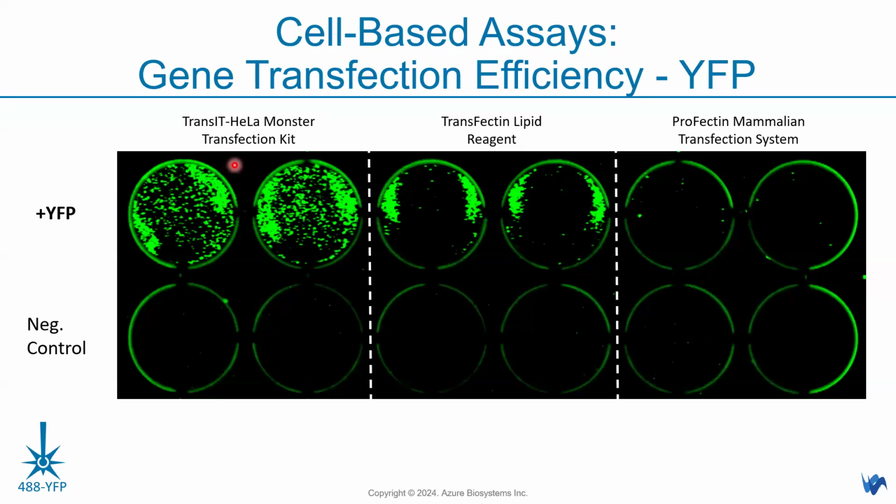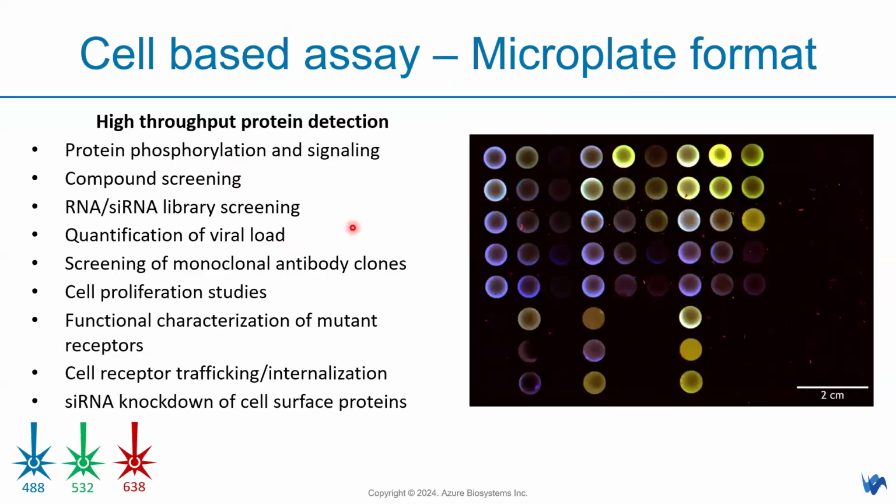Right, next, this is on microplate format, which is much utilized in vaccine research and the rest of the research in the world. So this is also a cell-based assay, but in microplate format, in 96-well plate or 384-well plate. Why do people use this format?